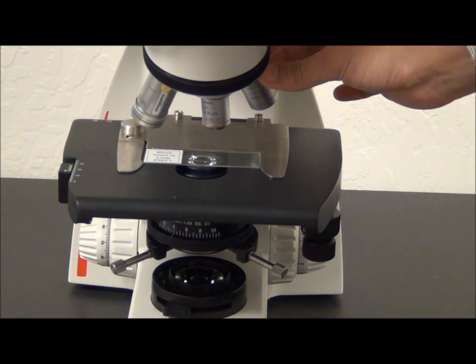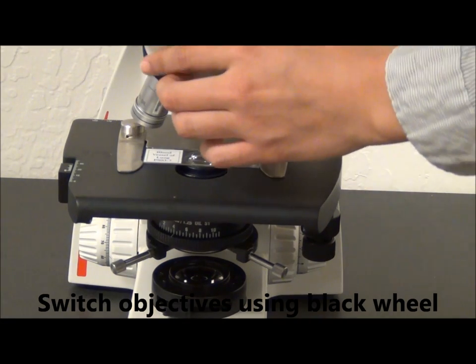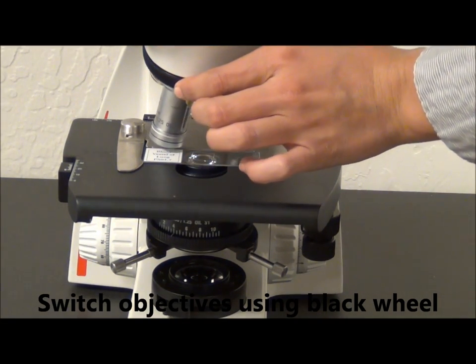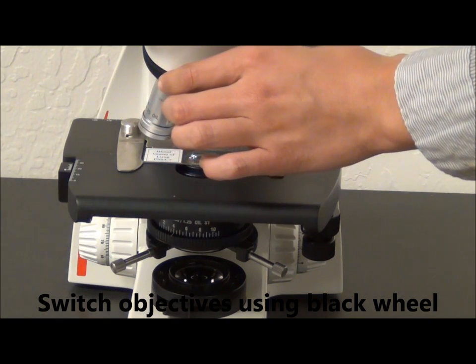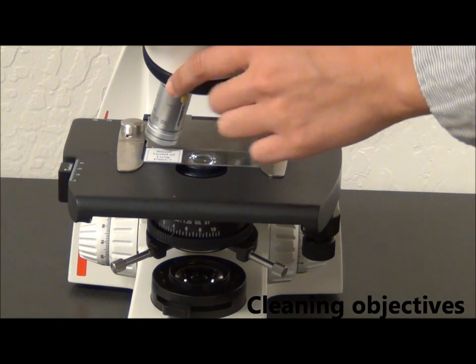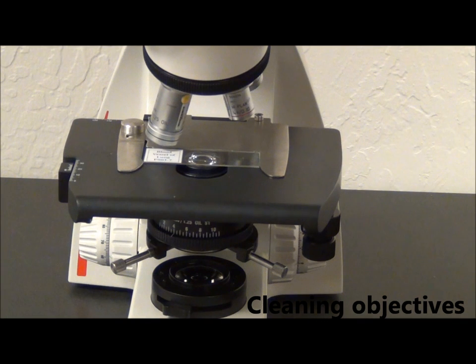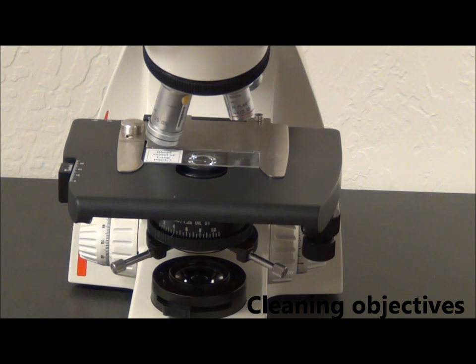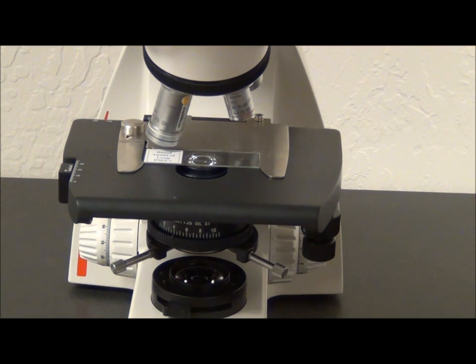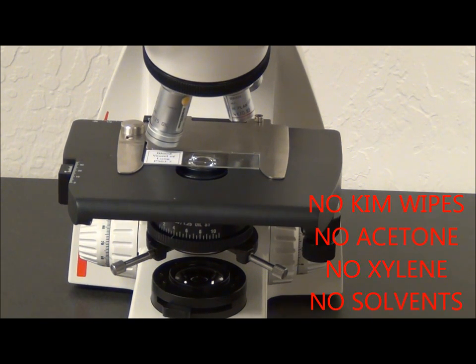Moving down to your objectives. The best way to switch objectives is to use the black rotating wheel, to avoid potentially off-centering your objectives. The best way to clean your objectives is with lens paper and isopropyl alcohol or rubbing alcohol. If your lens isn't too dirty, try breathing on the lens and then wiping it with a lens wipe. Never use anything that could corrode the surface of the lens and make your image cloudy, like chem wipes, acetone, or any harsh solvents.